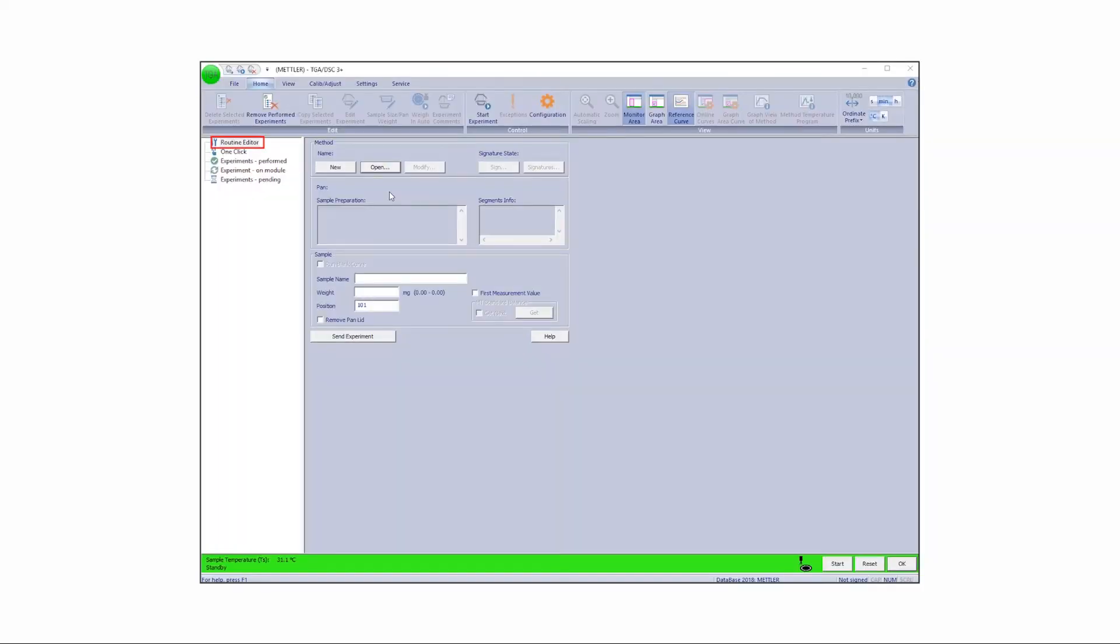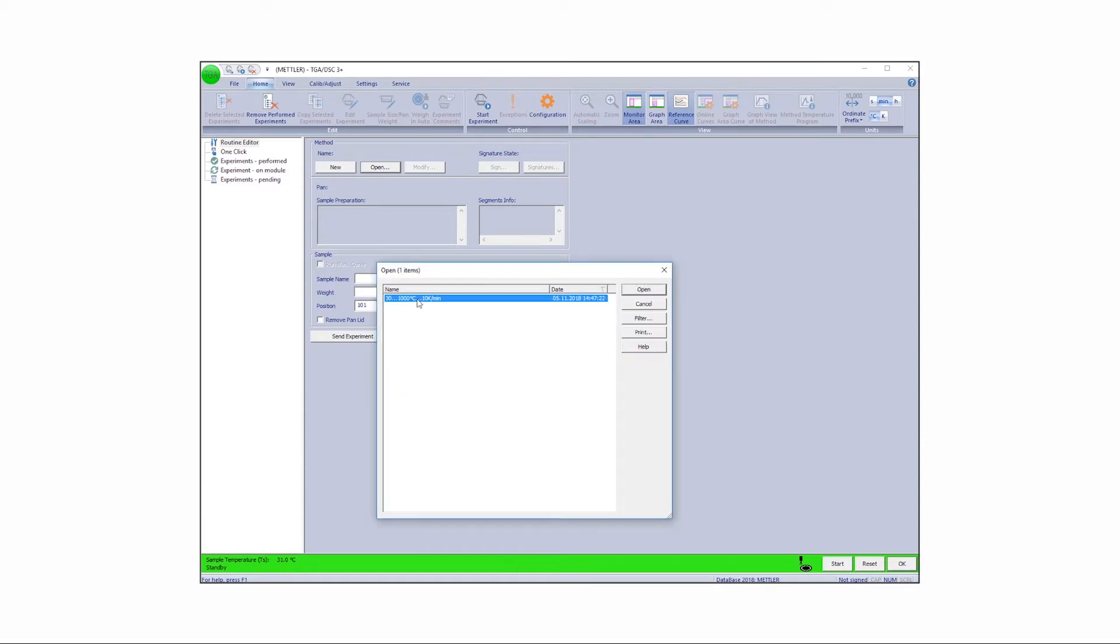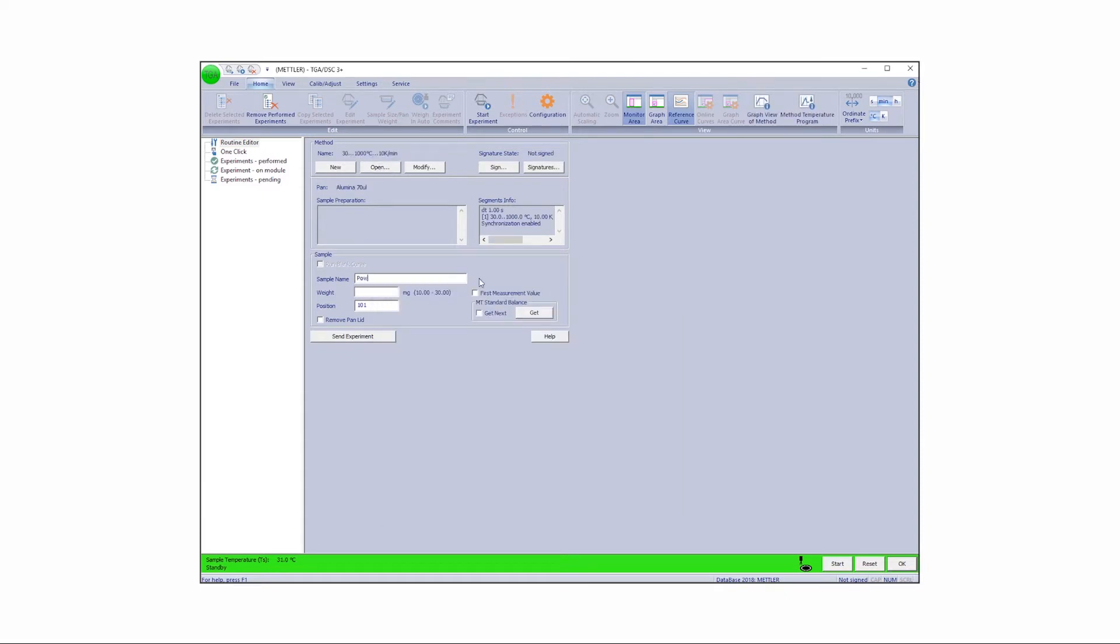In the Routine Editor, open the method and enter the sample name.